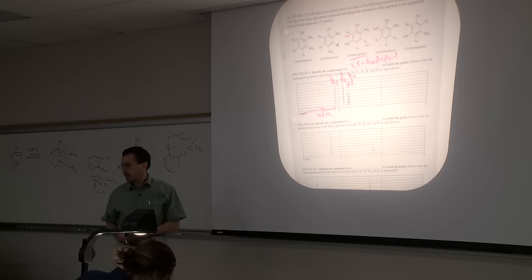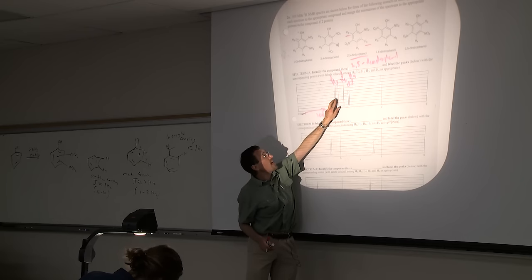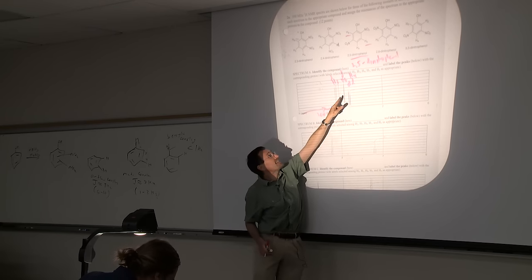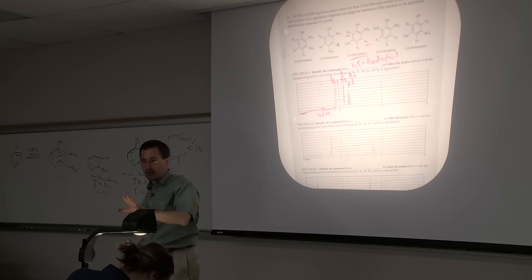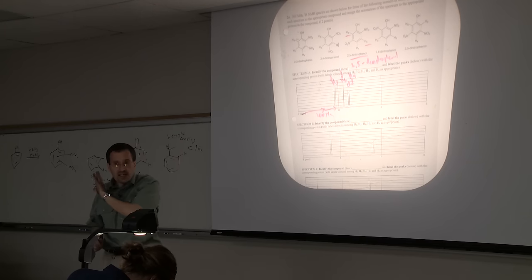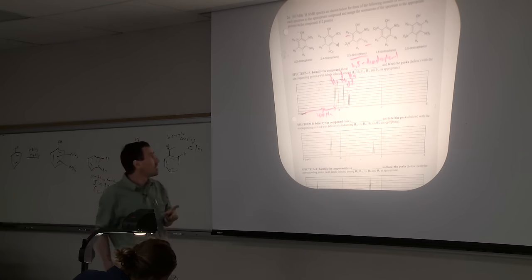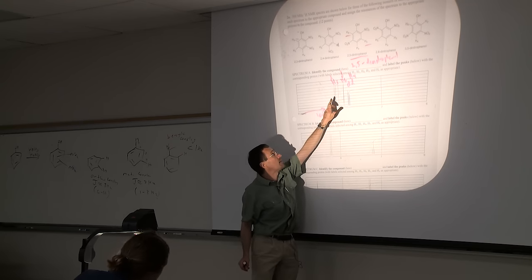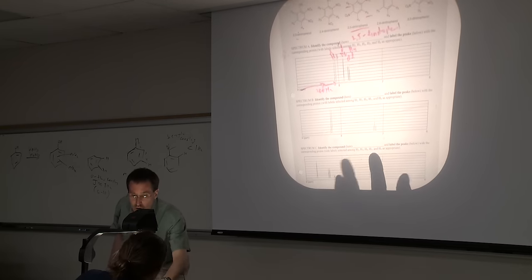That's what I'm measuring. And what's nice is now we've calibrated ourselves, because now I put all these spectra on the same scale. Now we know that distance is about 8 Hertz. That distance is about 2 Hertz. So now, even though we don't have a ruler on the scale, we're calibrated in our mind's eye. If we had an ethyl group in there, remember I said 7 Hertz on an ethyl group, 7 Hertz on a typical sp3-sp3 coupling, you'd have your ruler from that ethyl group and you'd be able to eyeball it. But I've started us out here and now we can eyeball it. 8 Hertz, 2 Hertz. So look at the next spectrum and let's figure out who it is.